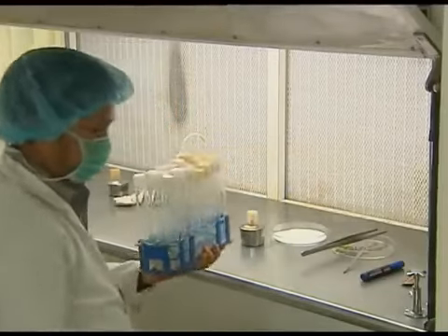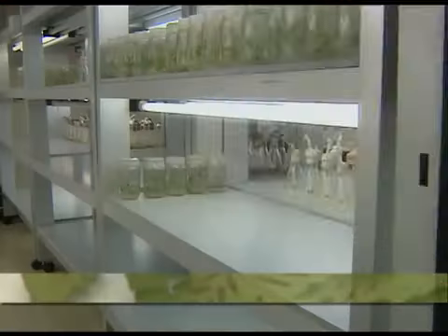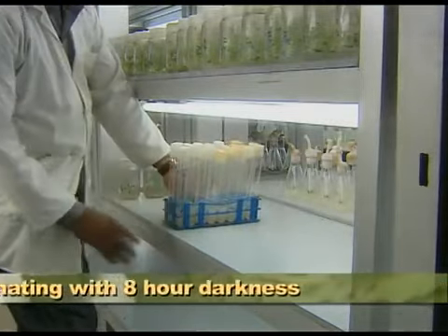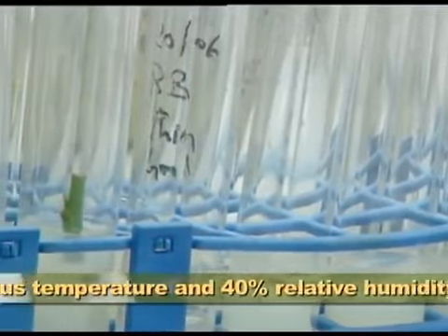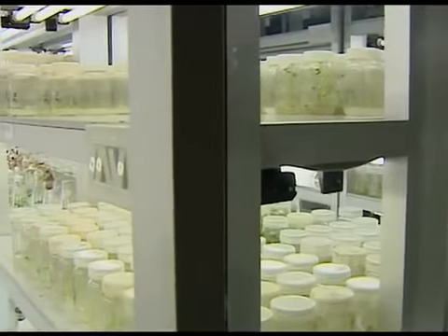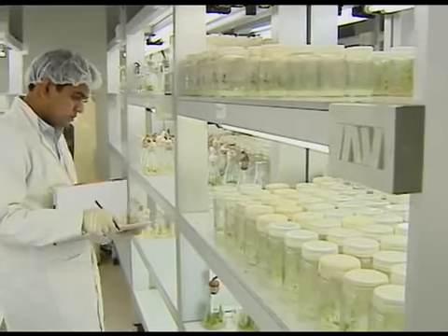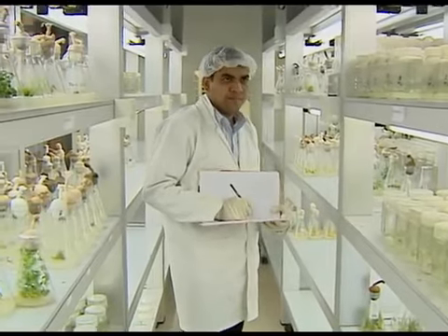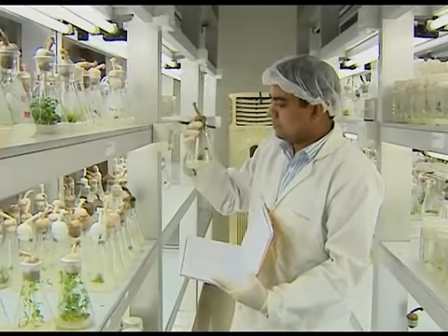The cultures are now ready to be incubated in the culture lab at optimum conditions of 16 hours light alternating with 8 hours darkness, 25 to 27 degrees Celsius temperature, 40% relative humidity, and it is monitored timely. After a few days, which may range from 5 to 15 days, all cultures with either bacterial or fungal contaminants are removed and the corresponding cultures are allowed to grow further.